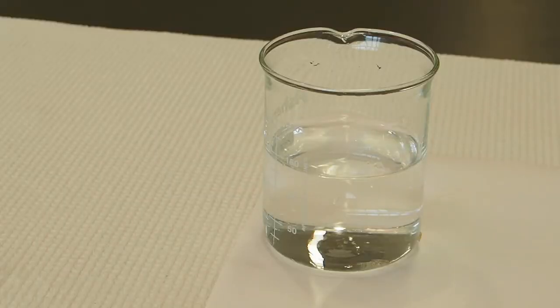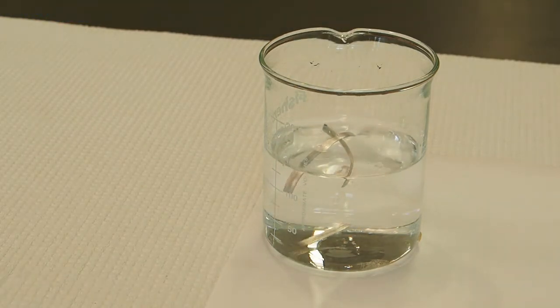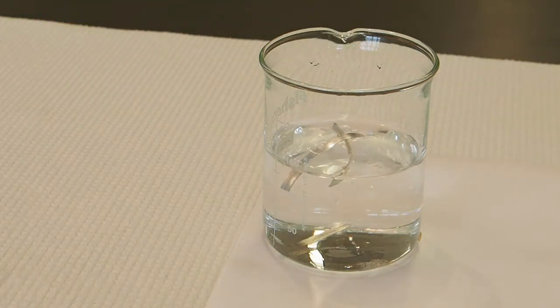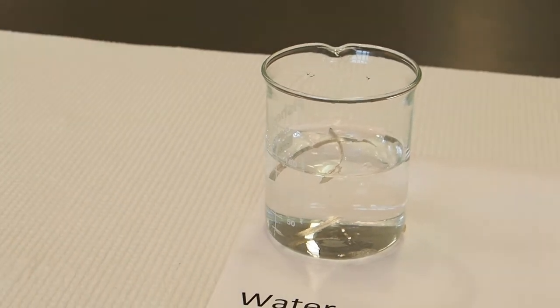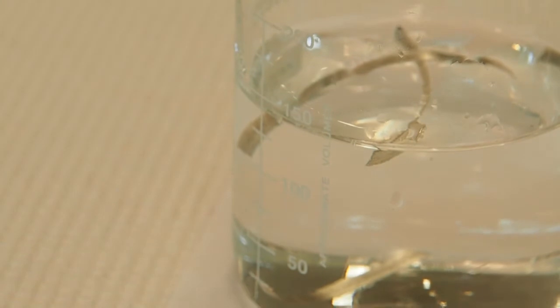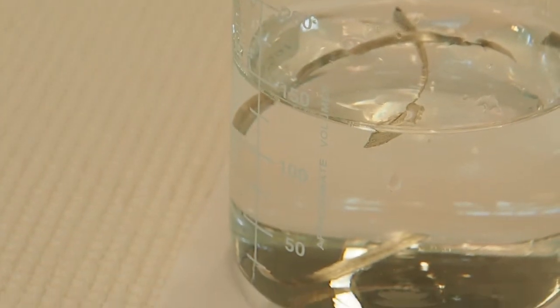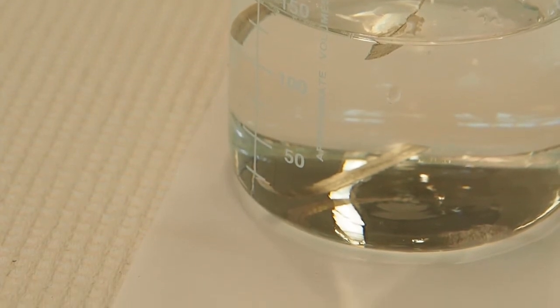Okay, so we're going to add some magnesium ribbon into the water and see if it reacts the way sodium did. So just add it in there. And it looks like it's not doing much. Let's zoom in a little bit and see. Okay, it looks to be not reactive. It's not reacting and it's not dissolving.